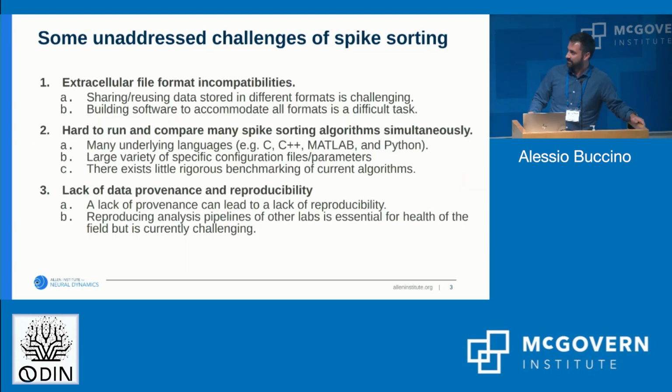And this is because it's very hard to actually address electrophysiology data. There are some inherent complexities and challenges in the field. First of all, and maybe differently than imaging, we have really many different acquisition systems which come with their own different file formats, right? So you need readers to be able to interface with different acquisition tools and so on. And building software that's flexible and can accommodate all these different formats is a difficult task.